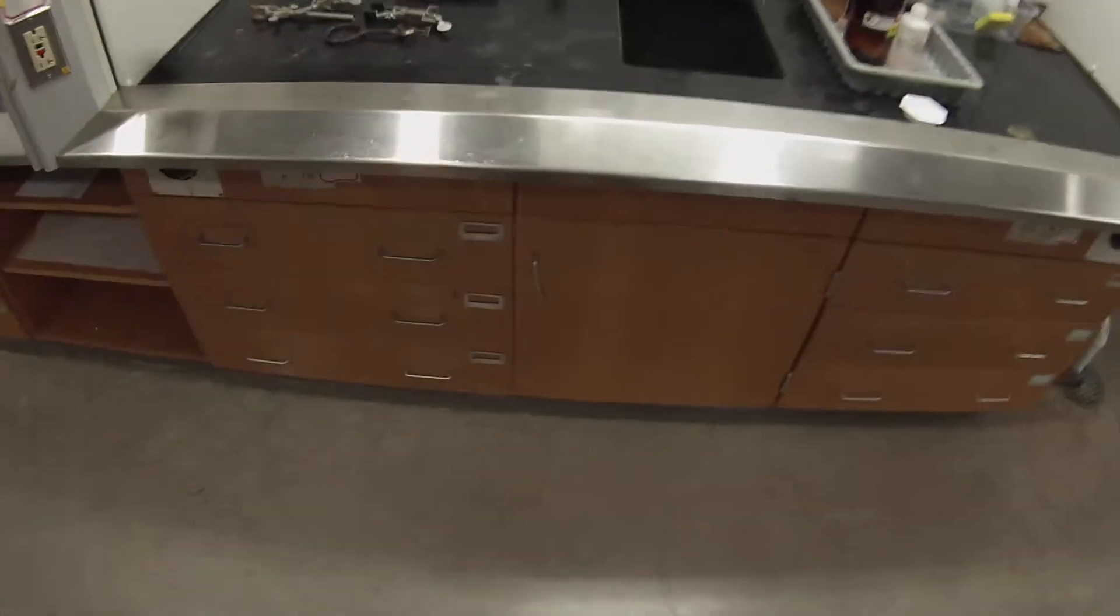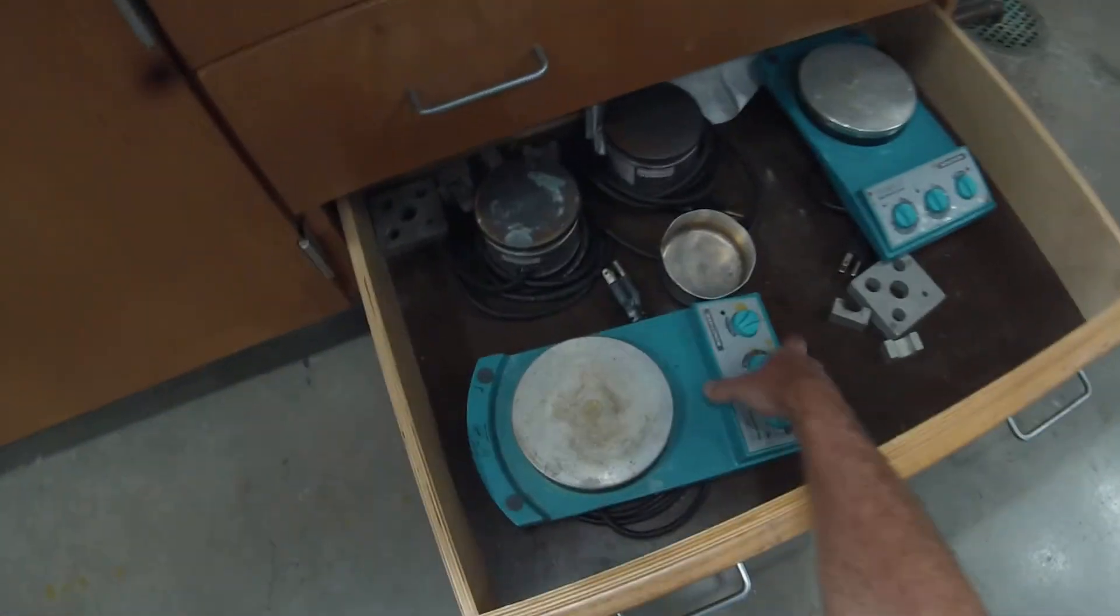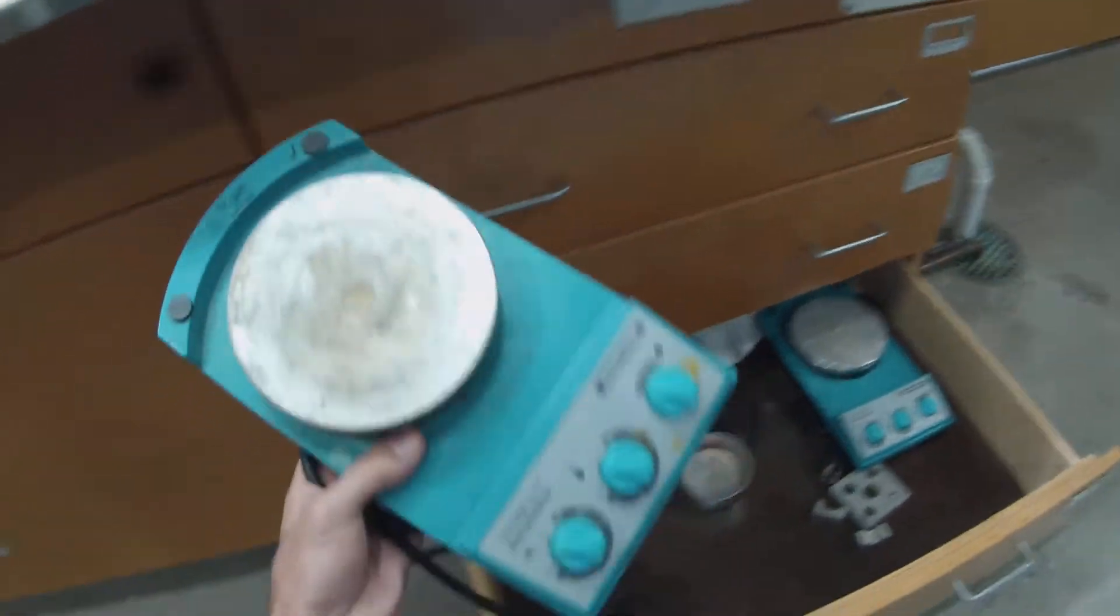So there are six drawers in each organic lab and they should be labeled A for the top left and B for the top right, C for the middle left, D for the middle right, and then E and F. In drawer F is where you'll find things like hot plates and dishes, so we're going to grab one of these stirring hot plates.